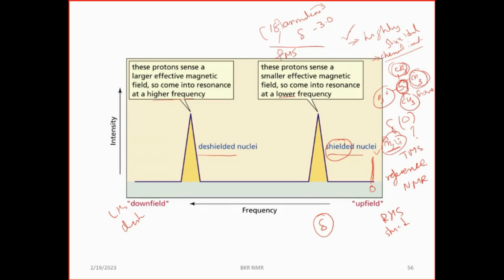So chemically inert. Next reason: TMS is soluble in most of the organic solvents, but methyl lithium is not soluble in most of the organic solvents. That is the problem. So solubility again. Next, I have 12 hydrogens that are chemically equivalent, so I'll have a very strong signal. Because the signal is very strong, a small amount of reference is sufficient, and I'll have a highly intense signal.